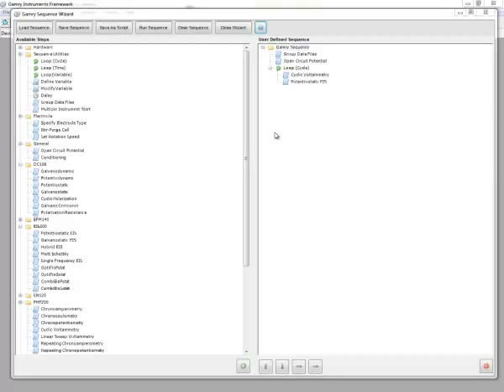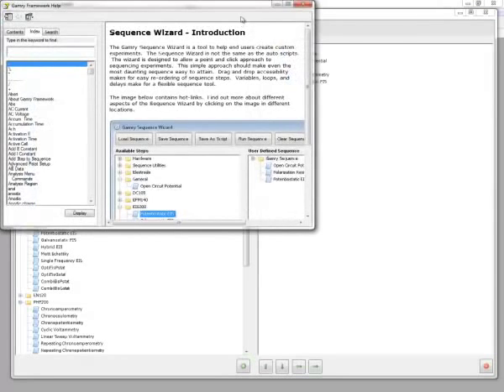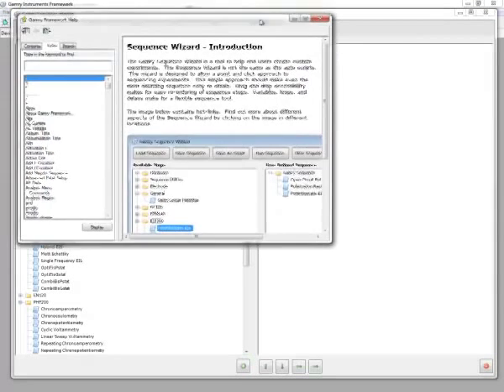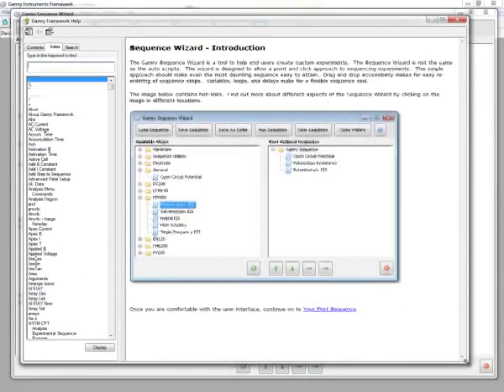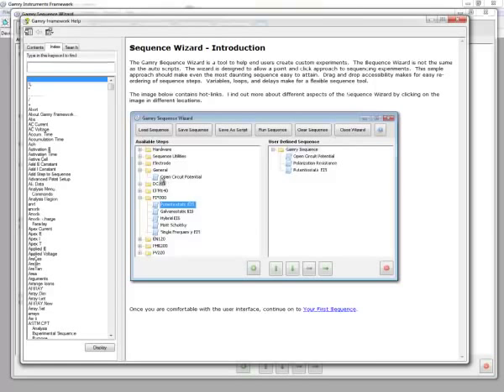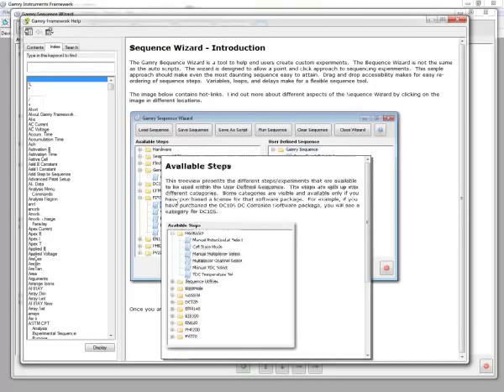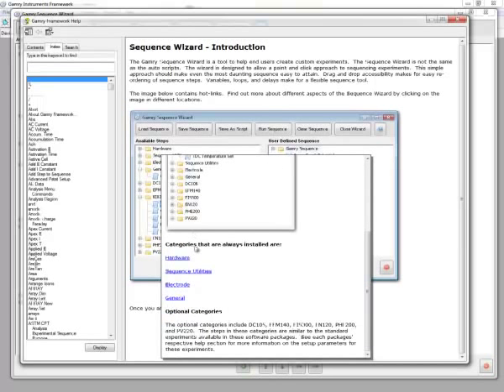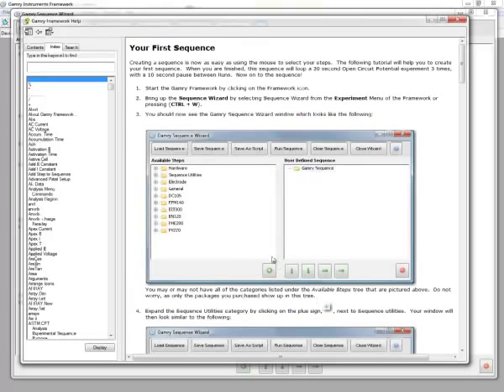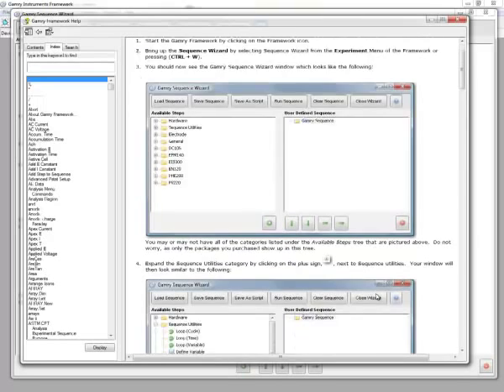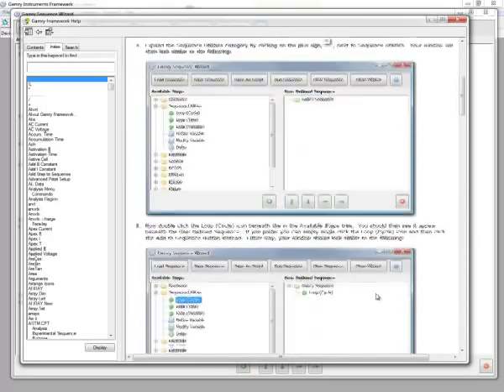If you have any questions while using the sequence wizard, click on the help button to bring up a nice interactive help file. Initially it will tell you a bit about the user interface if you click on here, and it will talk to you about available steps and how you can use the steps within certain categories of the sequence wizard. Once you're comfortable with that, you can click on continue on to your first sequence, and it will walk you through generating your sequence steps.